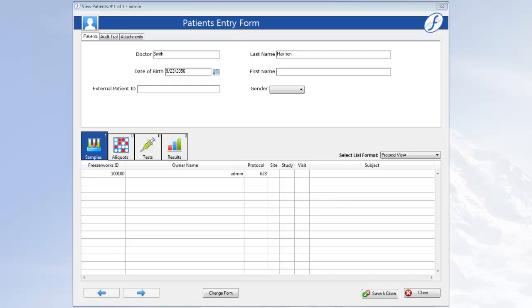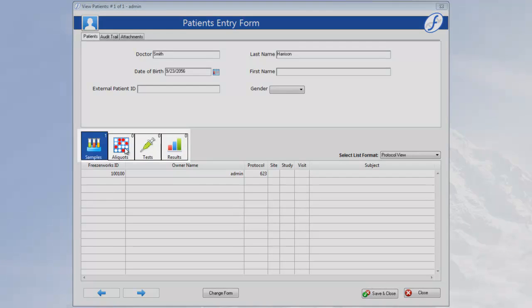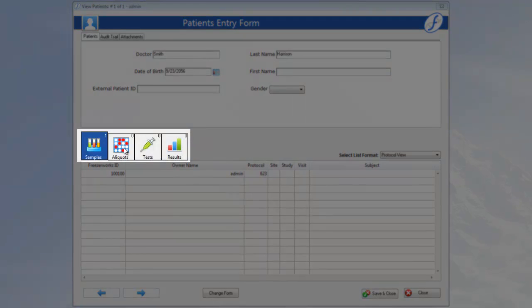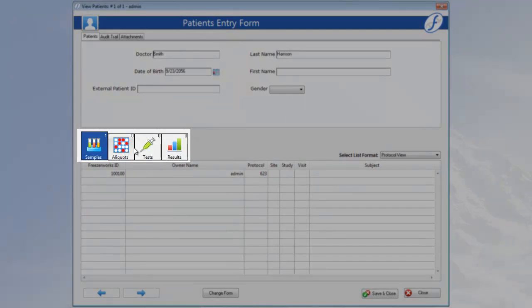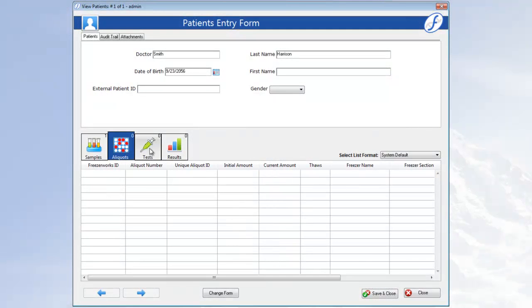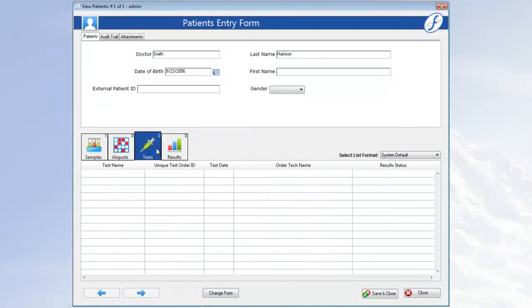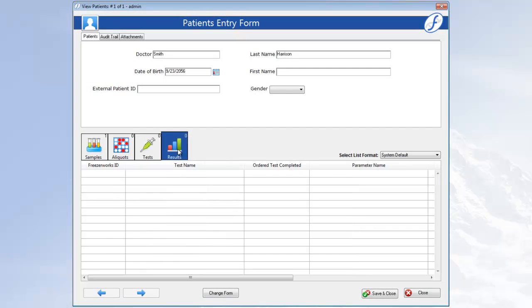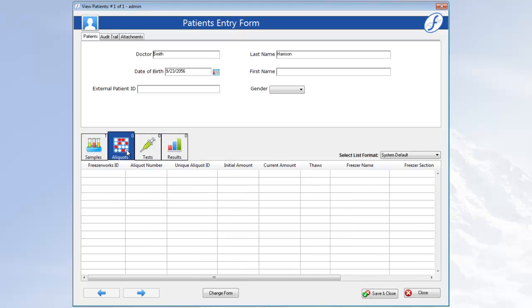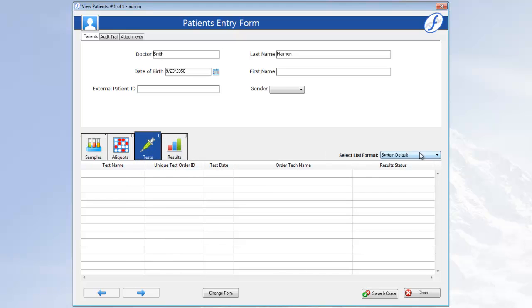Now, if the linked sample had any aliquots or tests, they would be visible here on their associated page. Now, the page buttons work just like the landing page, and the list format drop down changes to match the page selected. Well, that's how you link samples and Patients. Thank you, and until next time.